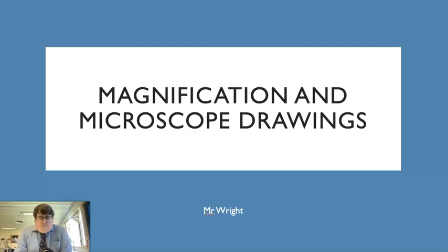Just another video for cellular biology. This time we're looking at magnification and microscope drawings. This one's a little bit hard to do online, and there will be a follow-up video where we look at actually using a digital microscope, and I'll show you down the slide of the microscope and how we actually go about calculating magnification of that and how we draw those images, etc. But for the purpose of this video, we're just going to go through a few definitions.